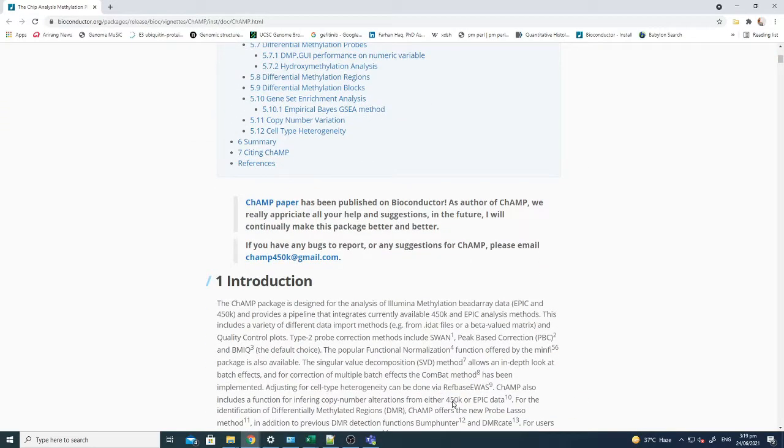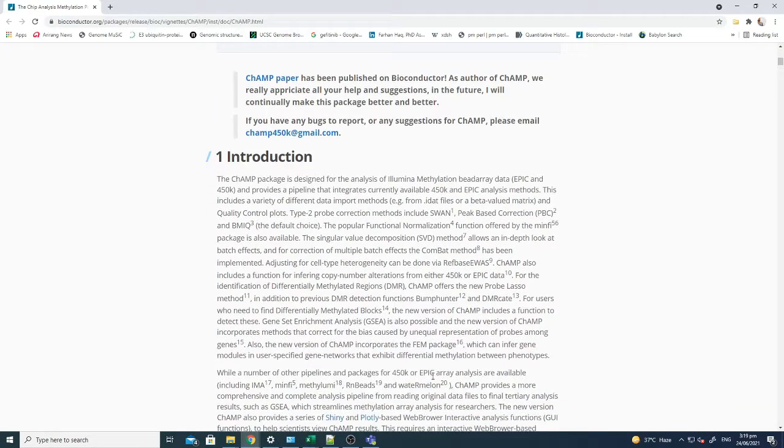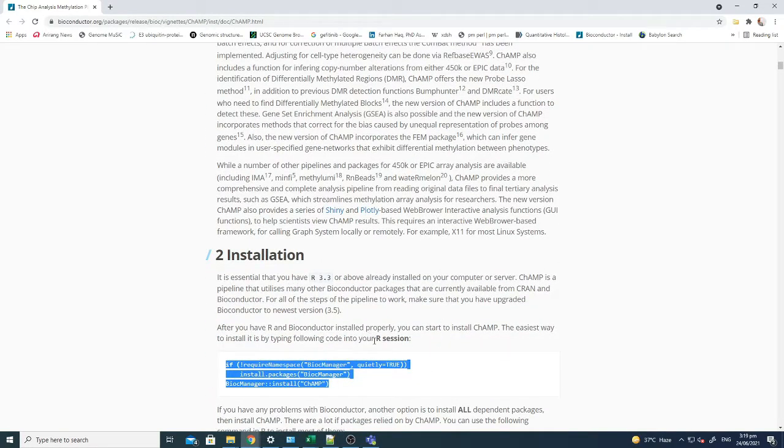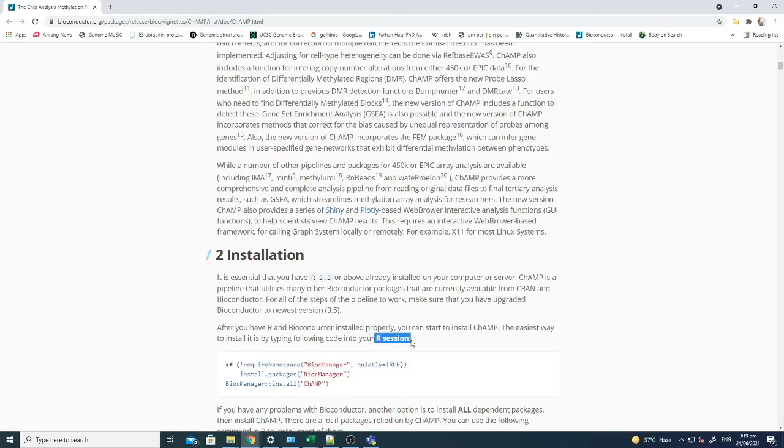There's a lot of different information available on the internet about how to use that software for your analysis, but you should know that first of all you have to have R software installed on your computer.